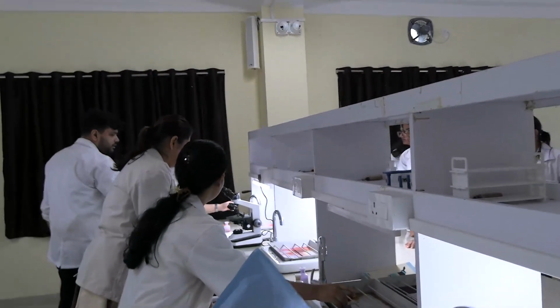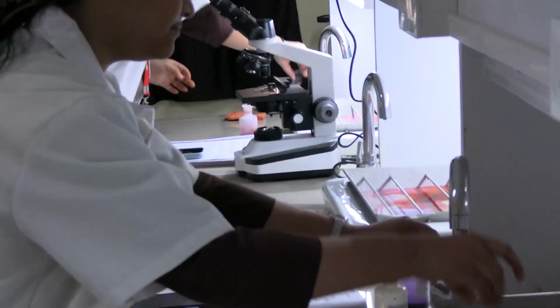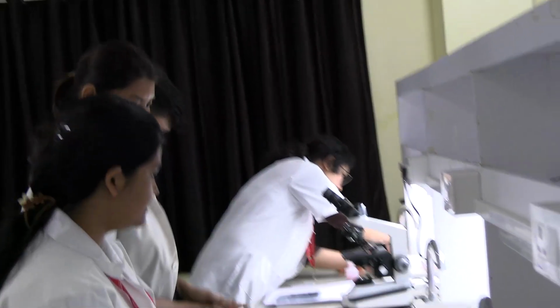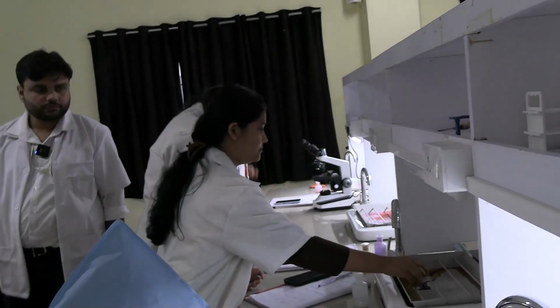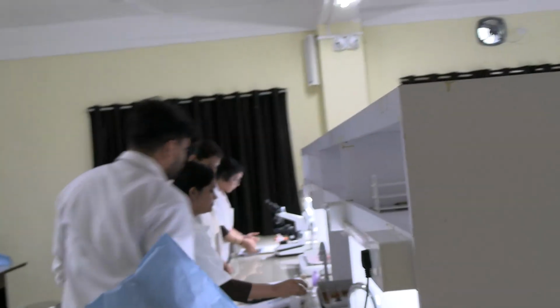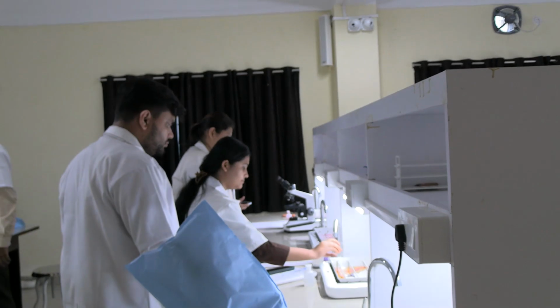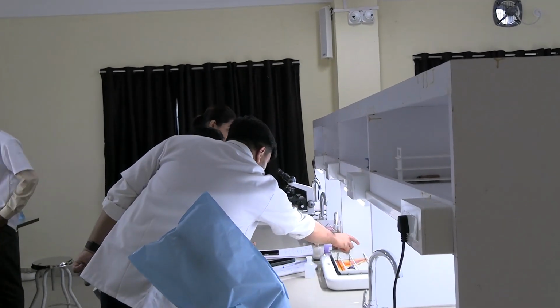Don't wash too much, otherwise everything is gonna get washed away. Now we're gonna place it in that crevice, okay? So that the excess water dribbles down. You're gonna do the same, okay? Tilt it a little bit and place it just between the faucet and that basin, okay? You don't need to do this, no? You can just place it here.